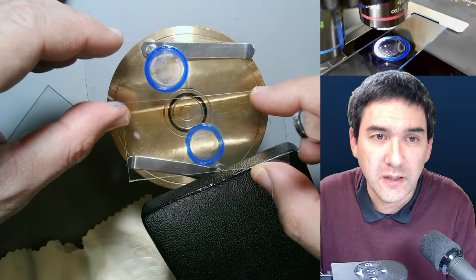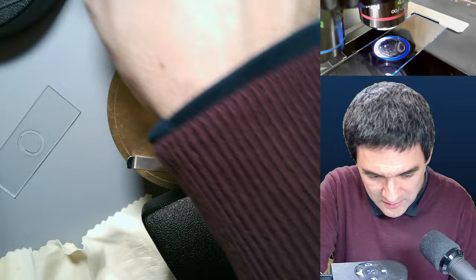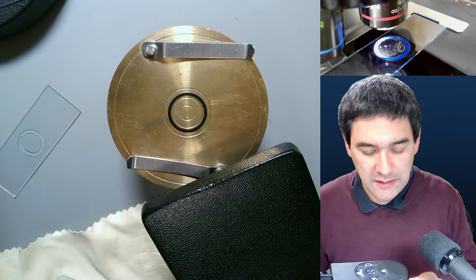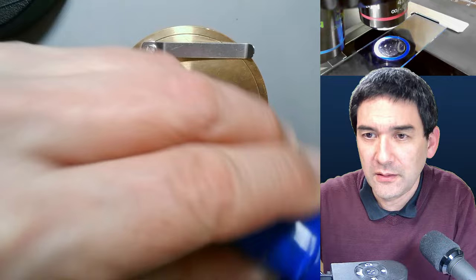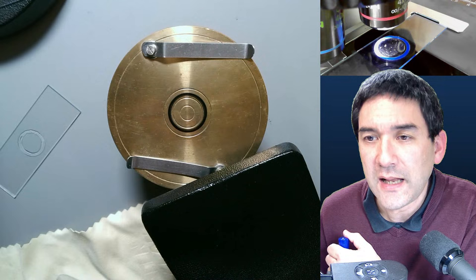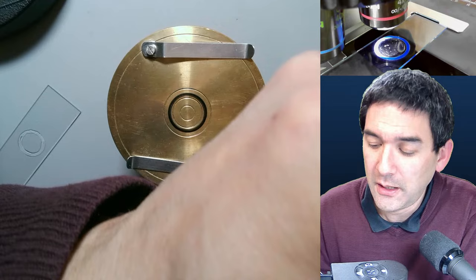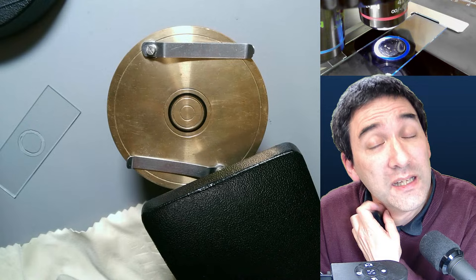Is this blue circle just regular nail polish? Does any color work? Yes, this is regular nail polish, and the reason I use blue is simply because I like blue. Clear nail polish works too, but it's difficult to see — it's clear on clear. So colored is easier to work with when making your ring slides.